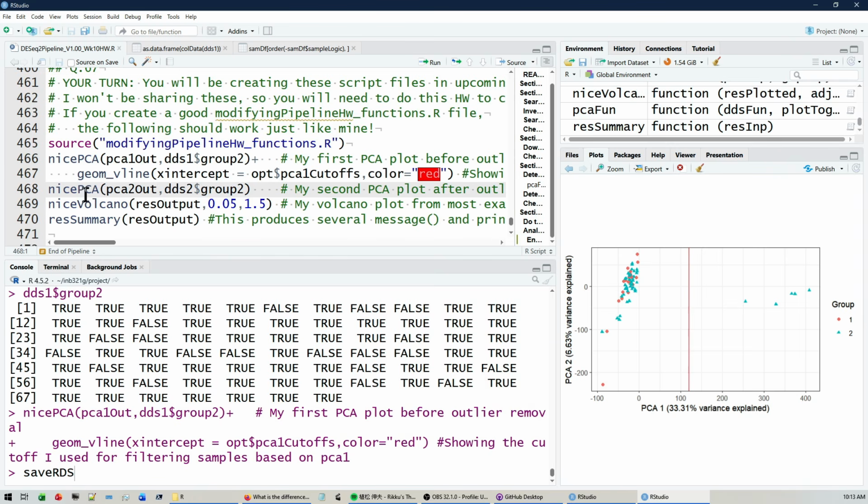You've got to make sure you structure your function correctly. That's where most students mess up: they just get overwhelmed by my attempt to describe this, and they don't look closely enough at the usage examples to see that really I'm asking you to use this object and then figure out how to write a function around that object. That's the real challenge.